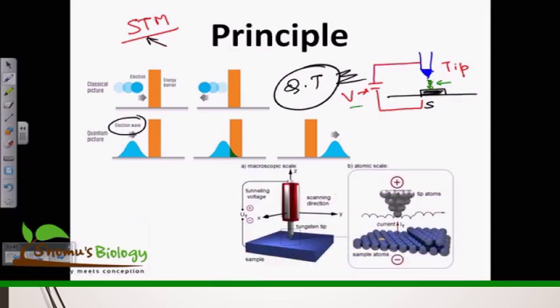If you look at this image, we can see pretty clearly that we use a tungsten tip here, and in this case you can see this is the tip of the atom with a positive charge, and here are the sample atoms with negative charge. We create this voltage, attaching these two things to pass some current between them. Here you can see the voltage arranged there.